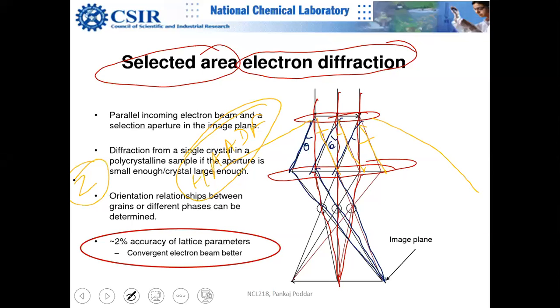So if you convert these electrons, you can convert them here. This is exactly similar to your X-ray diffraction peak. So this is one peak. If you see, these are from the same family of planes, because the distance is the same and this angle is also the same, right? So this diffraction angle is the same. These points are the same actually.